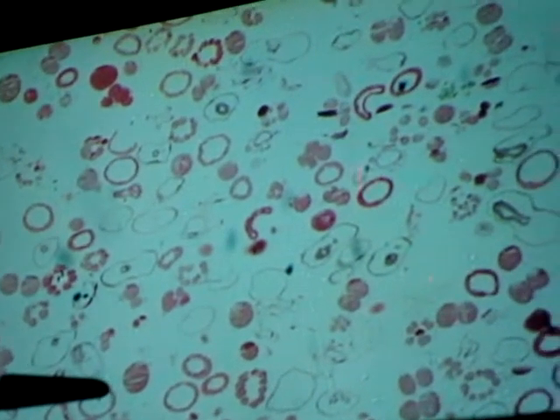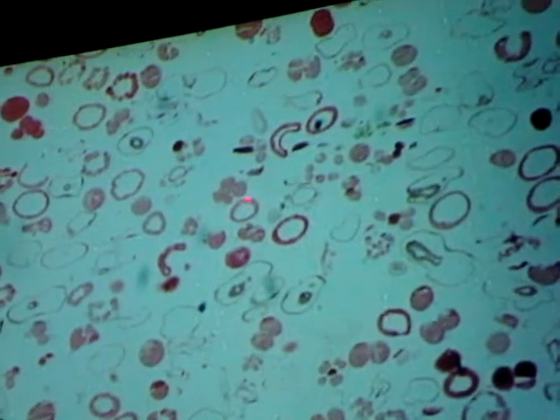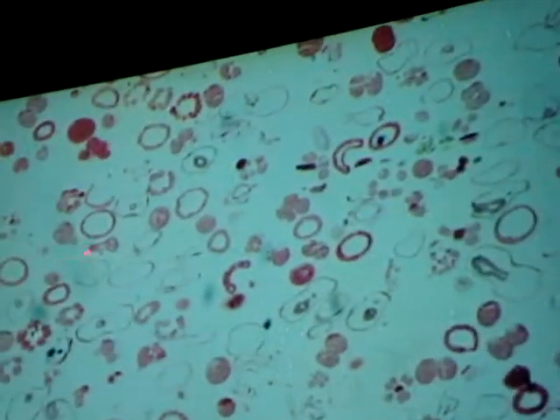All right, so a lot of these little rings, what are those? Blastocyst or blastula, either one. And so the blastocele is the space in the middle. What would that be? 2-cell. What would that be? 4-cell. That morula is going to be the one hard to find.